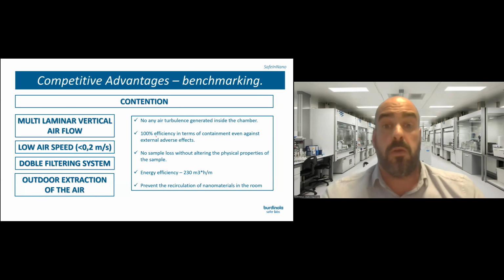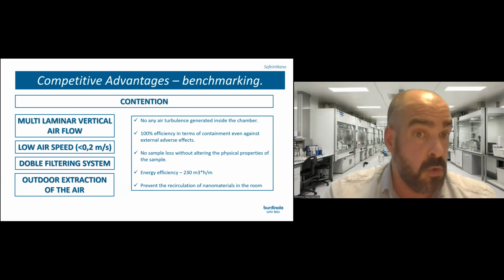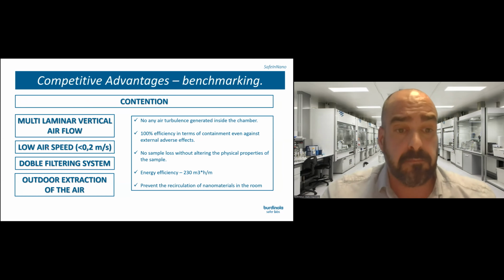Regarding the containment, what are the features related to it? The multilaminar vertical airflow, low air speed, double filtering system, and outdoor extraction.